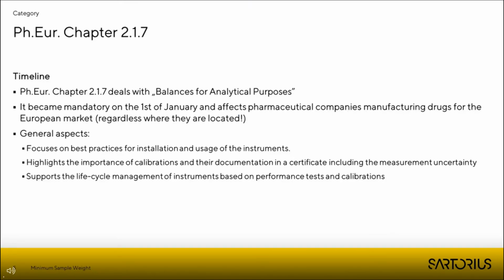The new chapter of the European Pharmacopeia deals with balances for analytical purposes. It became mandatory on the 1st of January this year and affects pharmaceutical companies manufacturing drugs for the European market. So this new regulation does not only affect companies located within the European Union, but manufacturing drugs for the European Union. The new chapter focuses on best practices for installation and usage of instruments.